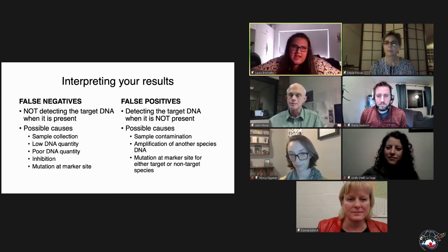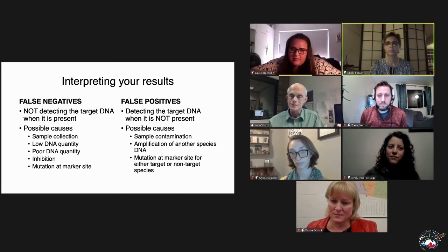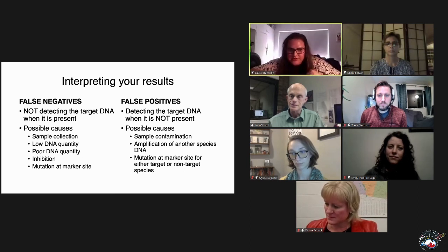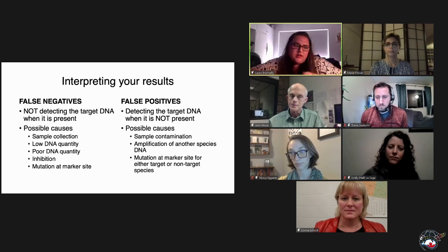I'd like to comment on that, the TAC. Yeah, we have tried that as well, based on your recommendation, John. I tested it with the eDNA kit that I extracted with, and it did increase the quantity of DNA that I was able to detect. But I think inhibitors also mess up your extraction level as well, because all of it's going through a filter, right? So if you're clogging that filter with those inhibitors, you're going to limit the amount of DNA that's going to come through, regardless of whether there are inhibitors in your final product. So especially if you have really dirty water, you do want to be careful about that. You want to use the best kit available, and that's going to give you a better yield, regardless of whether you use the extra steps of cleaning things up after the extraction.